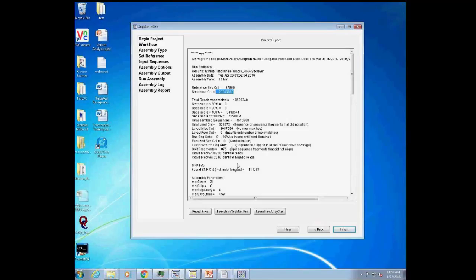But then I have others, especially if they have thinner coverage on the transcriptome. The thinner the coverage, the more variability you get in the signal. And so if you have thinner coverage, those people tend to use replicates. And then a t-test is usually the way to go.